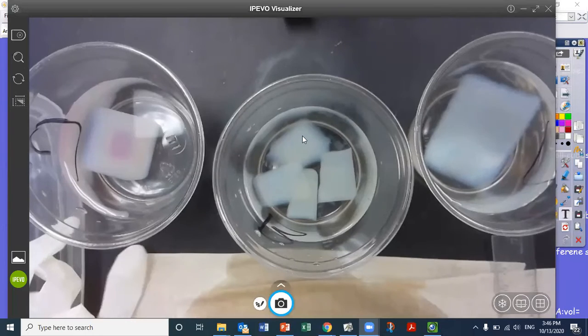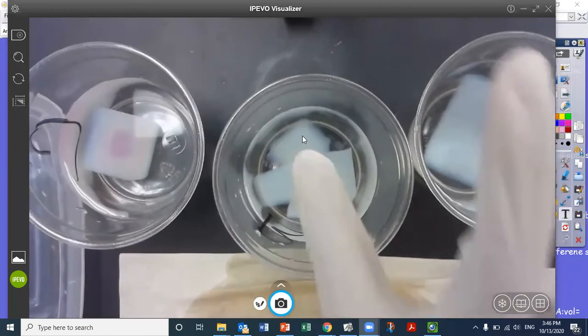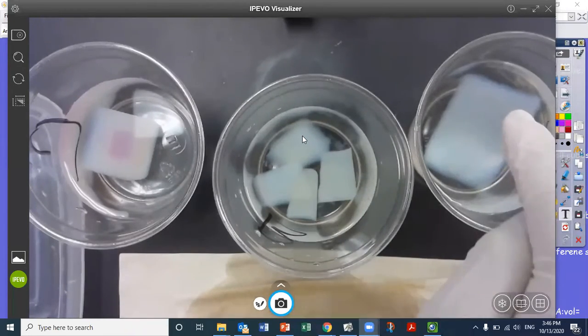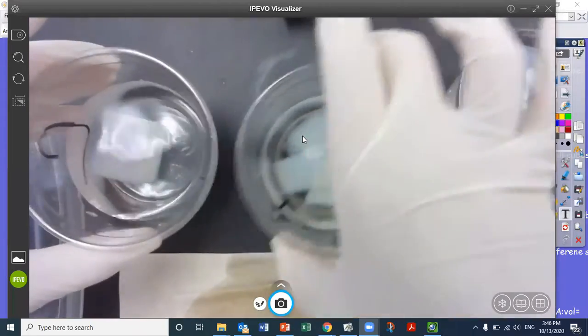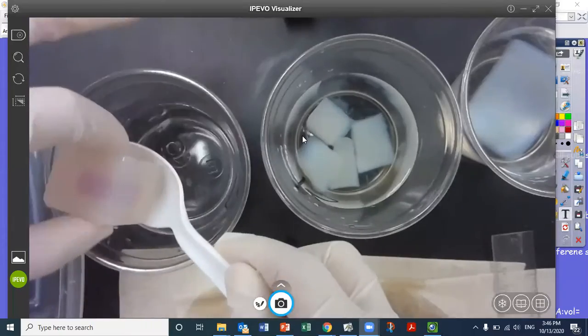All right, so this is going to be our last data point collection, and it is going to be our 40 minutes data point collection. And as you recall, we did finish out the small cubes last time. We finished out the big, flat, different shape a long time ago at 10 minutes. And so the last one we're waiting on is the big cube. And we're not actually going to wait until it finishes all the way.